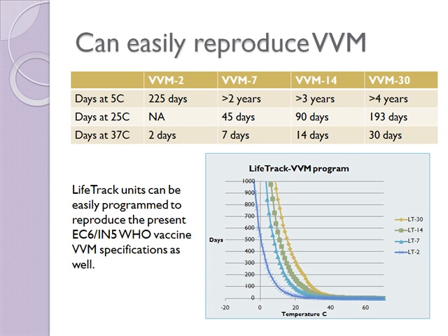But we can go one step further. For example, for a freeze-sensitive vaccine, we can make it act like a VVM above the freezing point and take advantage of all the data that WHO has accumulated. But then we can make this VVM plus accurately show that the vaccine has been damaged by freezing, and we get the best of both worlds.